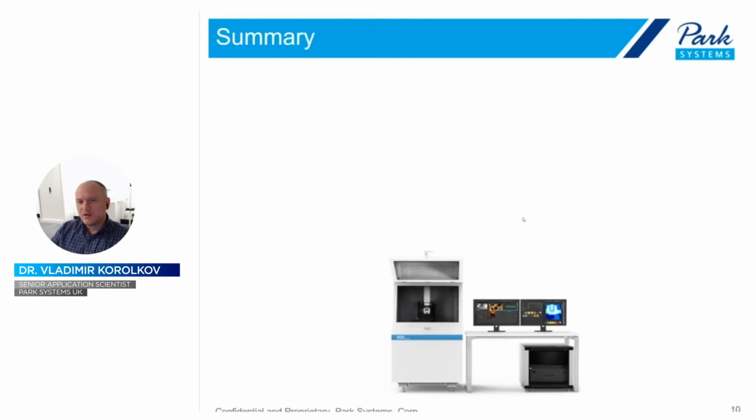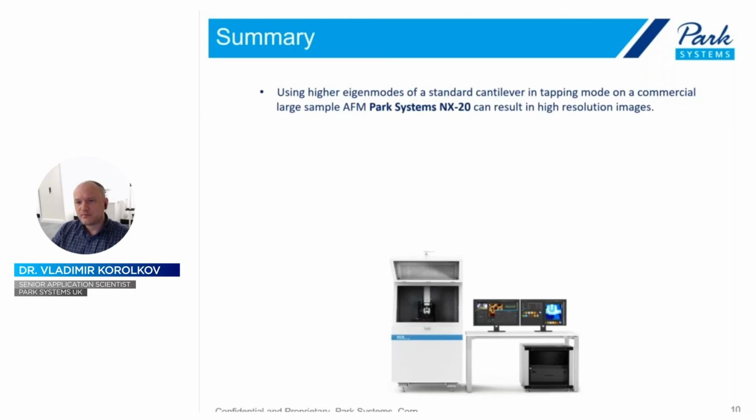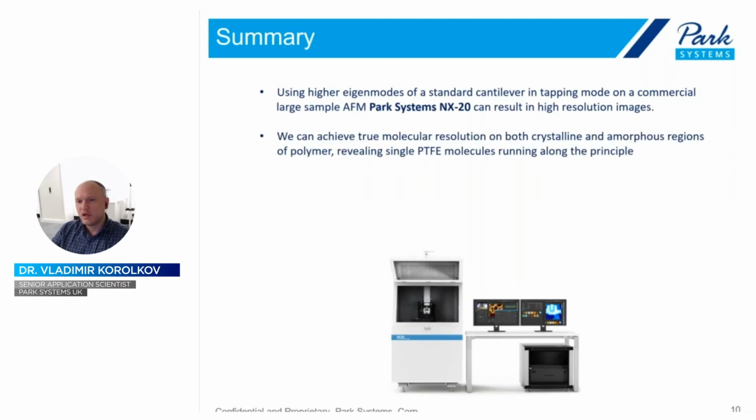Okay, right. To summarize, we can clearly tell that using that technique, using the high eigenmodes of the regular cantilevers on an NX20 or NX10 AFM, gives us a very good resolution. In fact, we can achieve true molecular resolution in both crystalline and amorphous regions of the polymers, revealing single polymer chains, on a sample that is just a regular Teflon sample that isn't even prepared for this type of imaging.